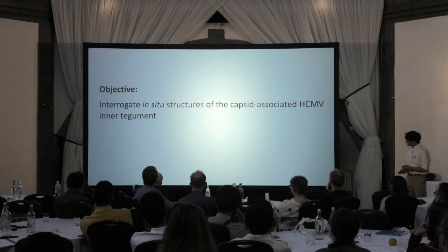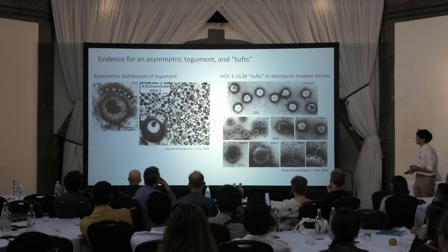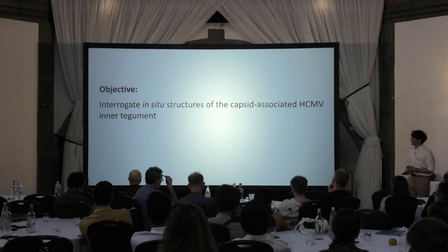However, Newcomb and Brown, this group in particular, have done quite a few TEM studies of herpesvirus tegument, and notably they visualized this asymmetric distribution of tegument around capsids, and also specifically these tufts, which emanate from these detergent-treated capsids. This is significant, we'll come back to this later. So, armed with that rationale, we now try to interrogate these in situ structures of the capsid-associated inner tegument.